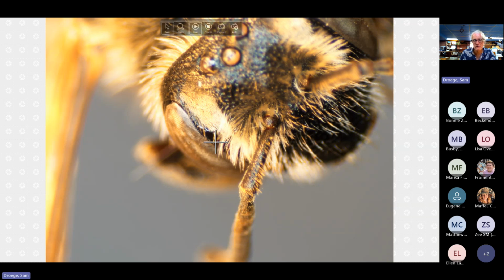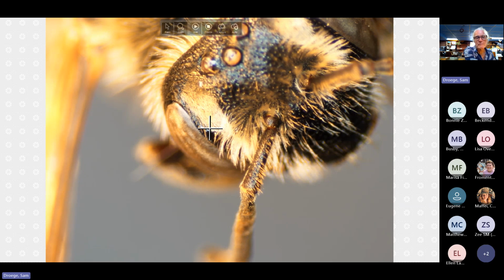Here in this case, we can't, but you can see here's the line, there's the eye right here, and here's the line, and then it cuts in. And so here's this bare space, and we look at that and say, oh, what's that percentage? So those are the key features that will tell you I've got a Trachandrena specimen here.